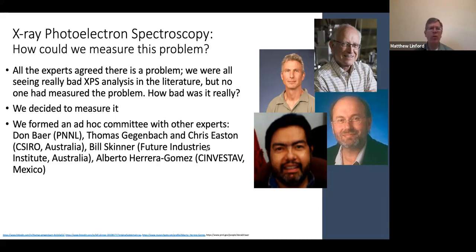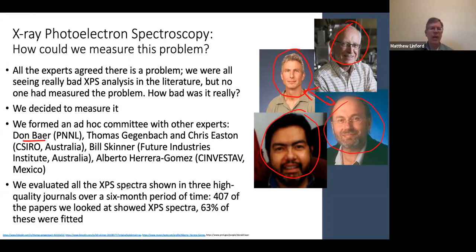And what we did is we formed an ad hoc committee of other experts. So we took Don, so this is Don right here, and then we took Thomas Gegenbach, and we took Chris Easton. I don't have a picture for Chris, and Bill Skinner, these two guys are from Australia. Don is from PNNL. And we worked with Alberto Herrera Gomez, who's from Mexico. And these are all really good XPS experts. And what we did is we evaluated all the XPS spectra that are shown in three high-quality journals over a six-month period of time. So there were 407 papers that we found that actually showed XPS spectra.